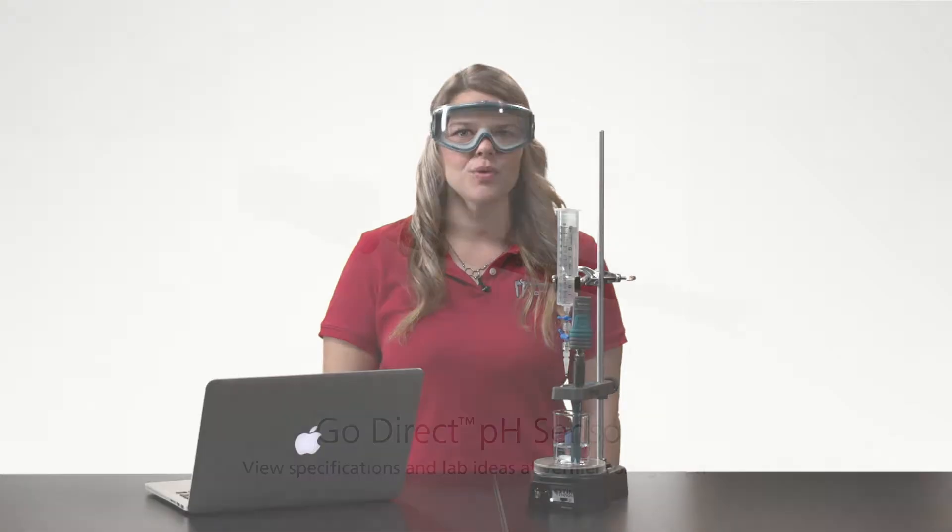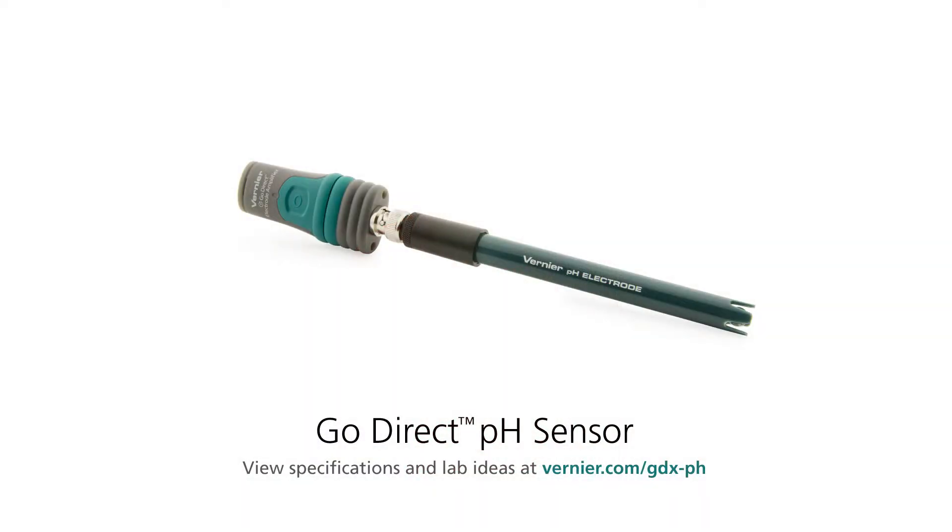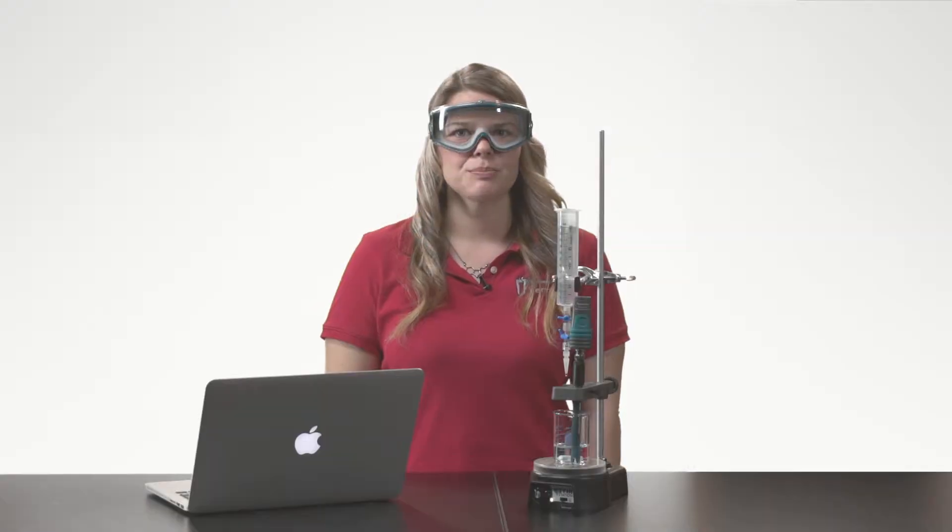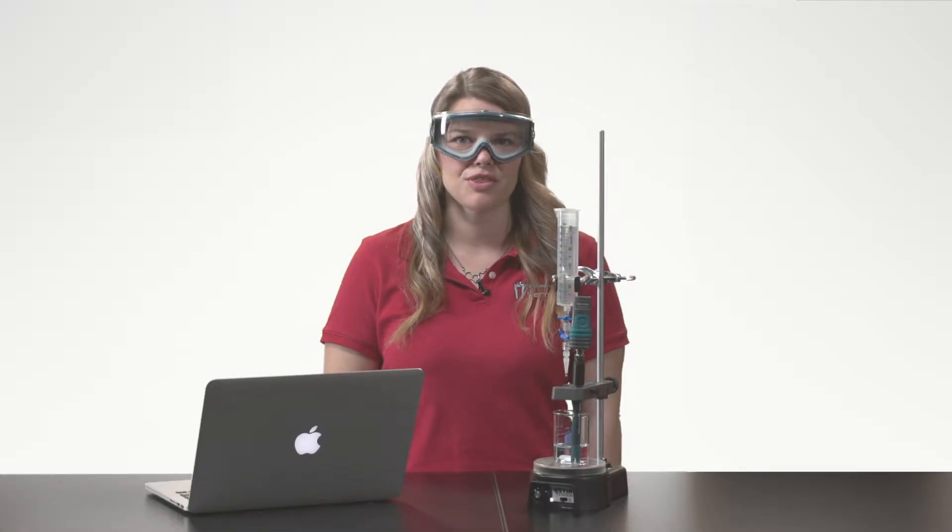In this video, we will be investigating a strong acid strong base titration with our GoDirect pH sensor and our GoDirect drop counter. A titration is a process used to determine the volume of a solution needed to react with a given amount of another substance.